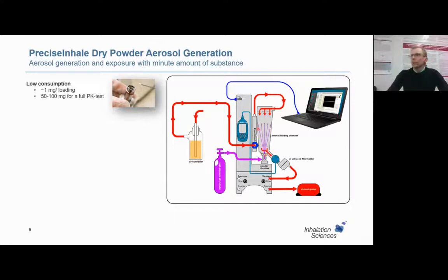To bring the aerosol out, we use a vacuum pump that can be regulated according to your needs. In this case, you have an end filter holder connected here receiving all the aerosol, but on this side you can connect in vivo modules or expose Ali. The incoming air is humidified to decrease static electricity effects. And before the aerosol leaves the instrument, we measure the aerosol concentration.